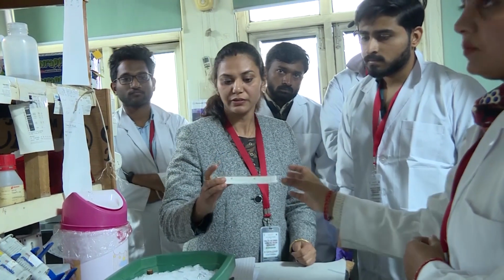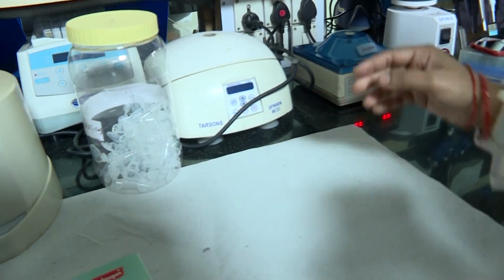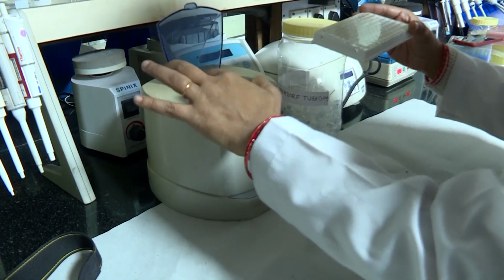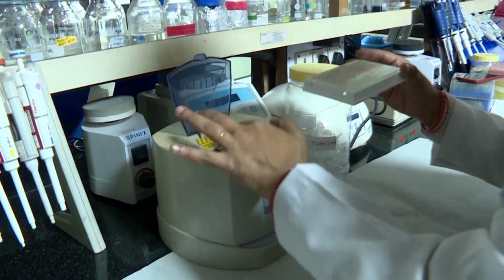Now we can spin it. There is a 96 well spinner. Why spin it? While putting, there is possibility that some sample may be at the wall. So all will come at the bottom.